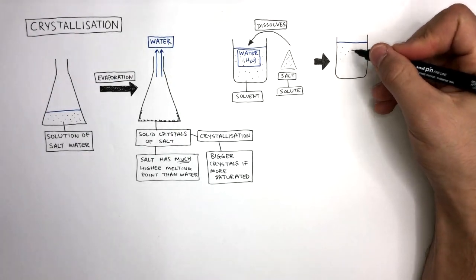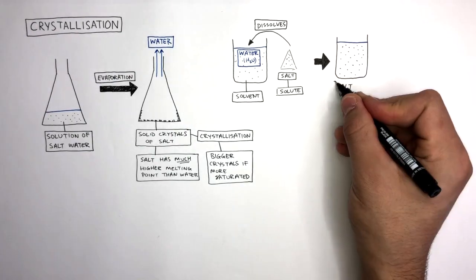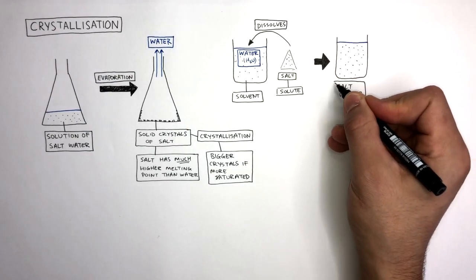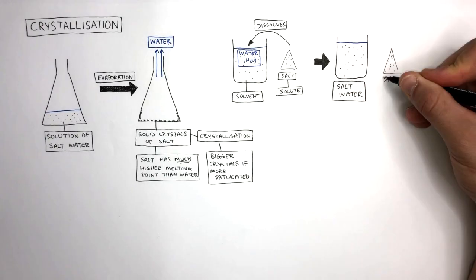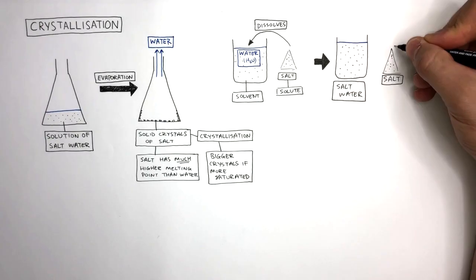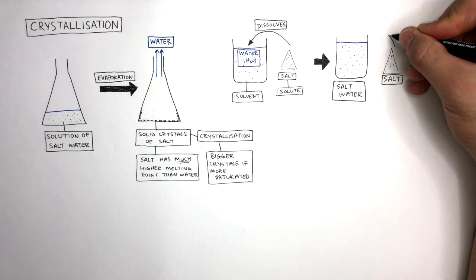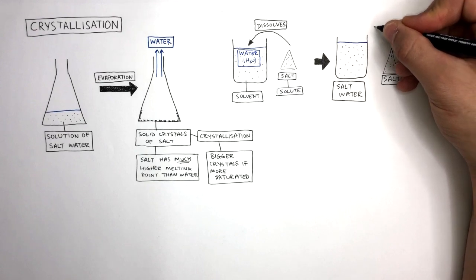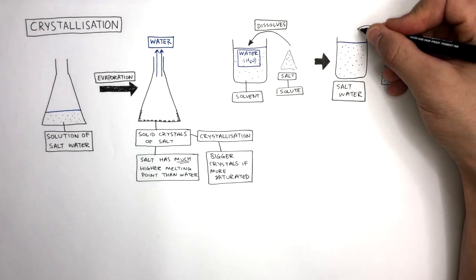Here is our beaker containing a solution of salt water having already dissolved a little bit of salt in the water. So here's some salt and if we keep on adding little by little, initially it does dissolve. We add a little bit more, it still dissolves.